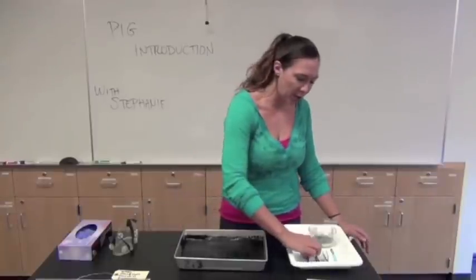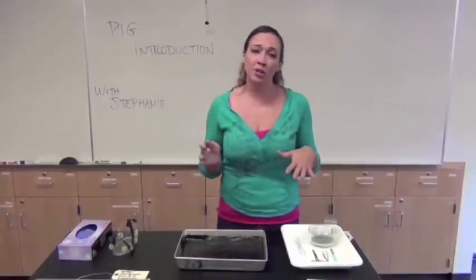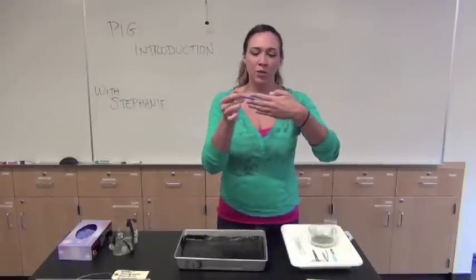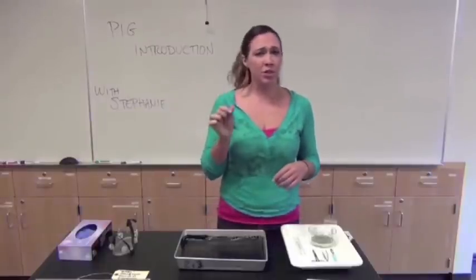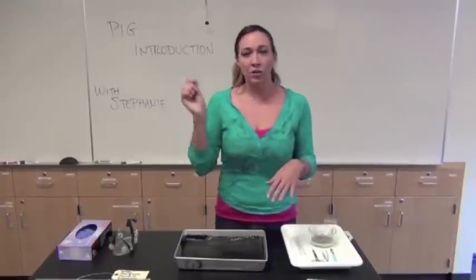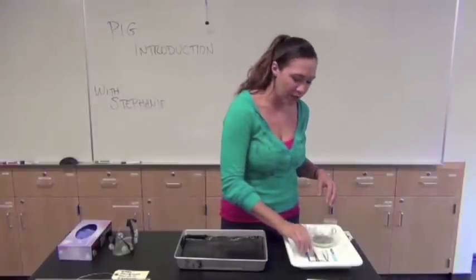The probe is a very fine-tipped picking tool. You use it to pick through membranes — you almost want to scrape through thick membranes and it'll start breaking them up. This is a great tool because you don't have to cut anything or press down; it helps you clear away areas to expose and identify the organs you're trying to get to.